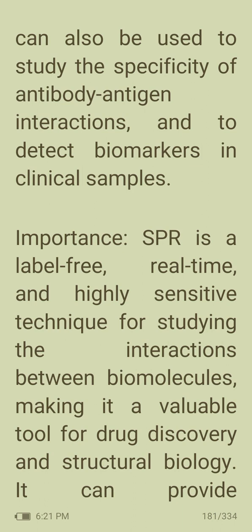What is the importance of SPR? SPR is a label-free, real-time, and highly sensitive technique for studying the interactions between biomolecules, making it a valuable tool for drug discovery and structural biology.